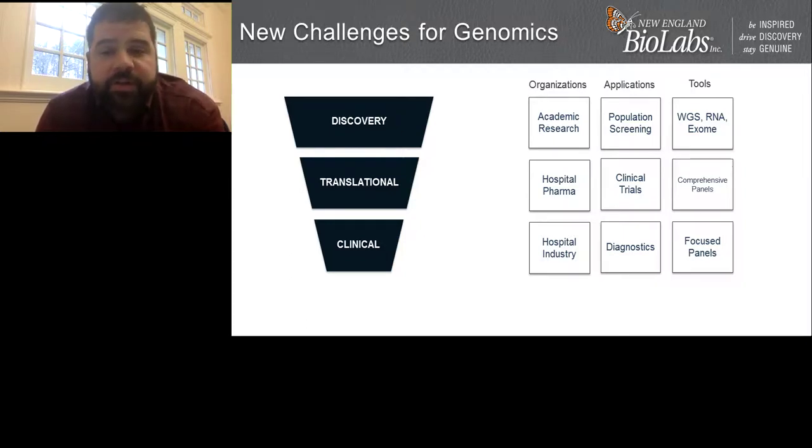When we think about it from the translational side, it really moves into organizations like hospitals and pharmaceutical companies that are looking to develop new treatment plans and test out these things through clinical trial processes and actually test those hypotheses to understand if the treatments that are being developed that are targeted towards a given genotype are actually impactful. And for those, seeing things like comprehensive panels that might include things that we know have a definite impact, but also some things that we want to learn something from, is kind of the trend that we see there.